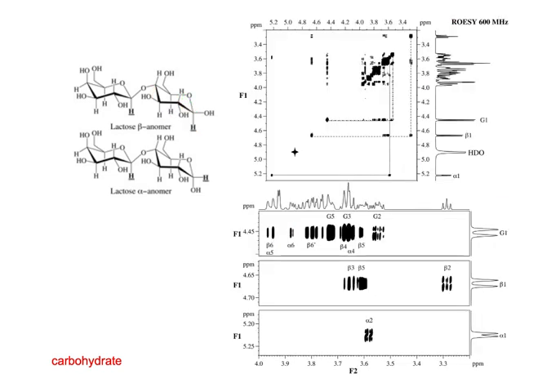All right, so what's this? Oh, this last one, remember we talked about that there were two different kinds of two-dimensional NOE experiments. And in this one, I don't know what the molecular weights are here, but they did the ROESY in this case, which is better. We talked about it especially for compounds that are in kind of that 1,000 molecular weight range.